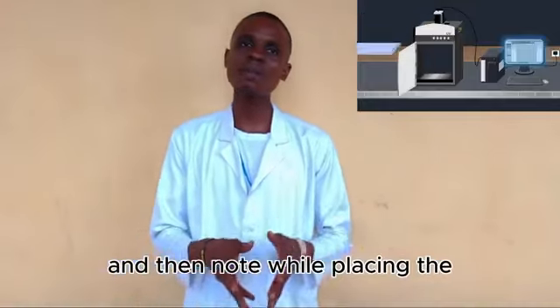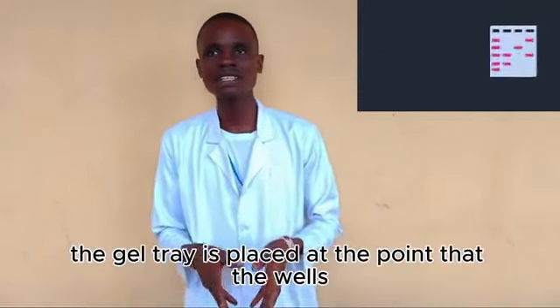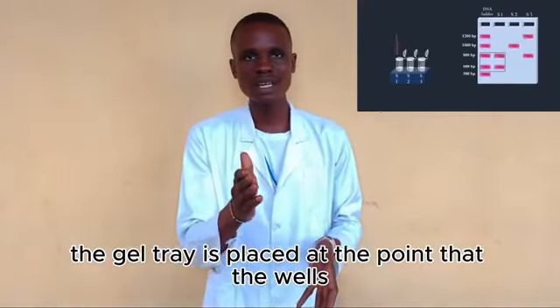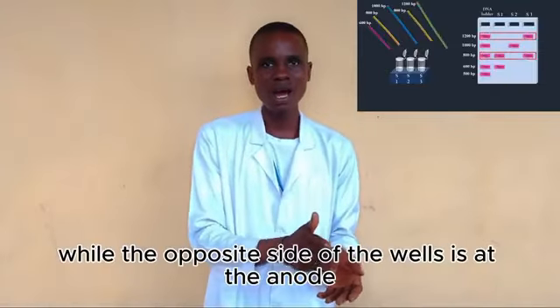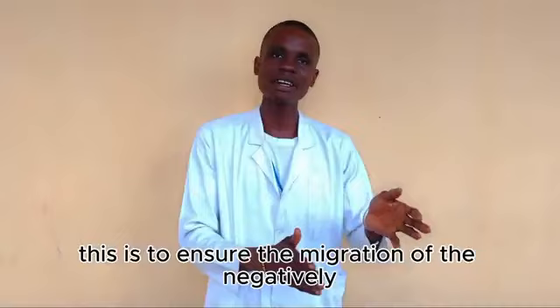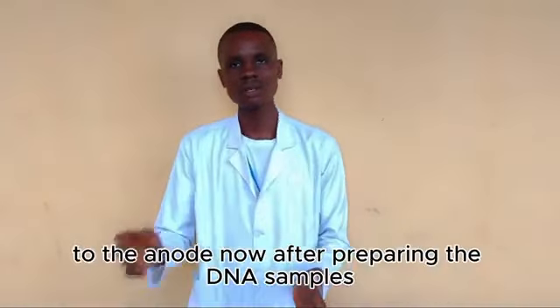Note that while placing the gel tray in the electrophoresis chamber, the wells created by the comb are at the cathode, while the opposite side of the wells is at the anode. This is to ensure the migration of the negatively charged DNA particles from the cathode to the anode.